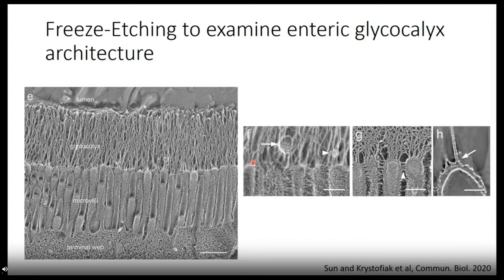What can we do with this kind of imaging? We can actually learn a lot about how this glycocalyx functions with the enterocyte. So just from this image, we were able to determine that there are several extracellular vesicles that appear kind of in the glycocalyx themselves. They may be going or coming, we don't know, but they are sort of trapped in here for now.